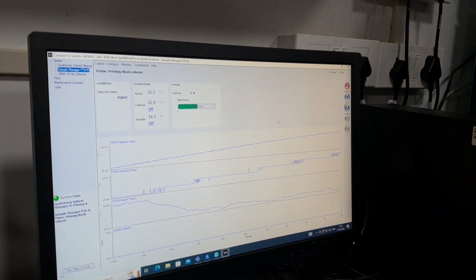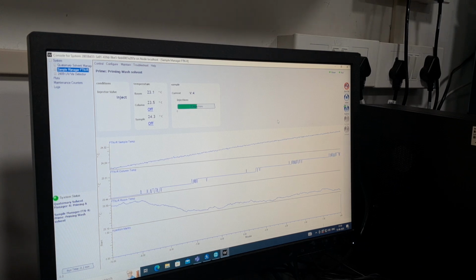Okay. This will be seen here through the needle wash. The needle wash comes from this output line. The flow goes here, and once it is completed, the syringe will be filled with the wash solvent. So the syringe goes up and down, then it gets cleaned completely. This is the needle wash. Once everything is done, then we are ready to put the flow through to the instrument.